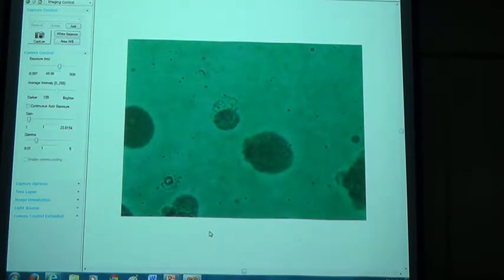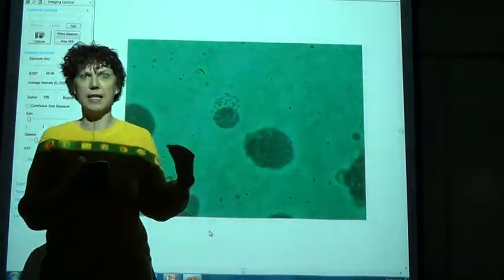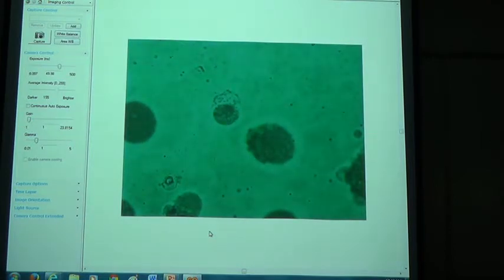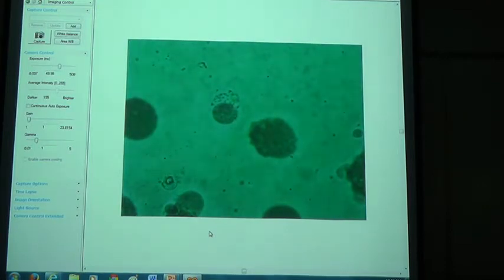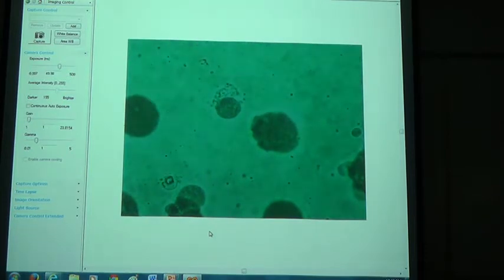And then, once you've looked around, you'll see some of them just come in and get stuck on that membrane. But when I did it earlier, while you guys were preparing for the quiz, I didn't see any that popped the membrane out and actually got fertilized. At least once you got through that process and recognize, compared to the video that we just watched, what needs to happen, then you can rinse that off. Just dry it with lens paper. And get samples of the cells that have already been fertilized. We have two to four and four to eight. Three images here. So, I'll change it to that. But just leave this up on here on the board for a little while.